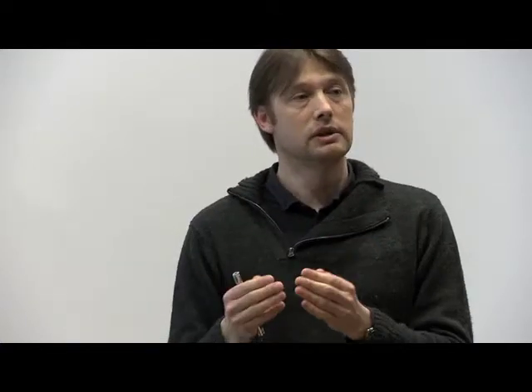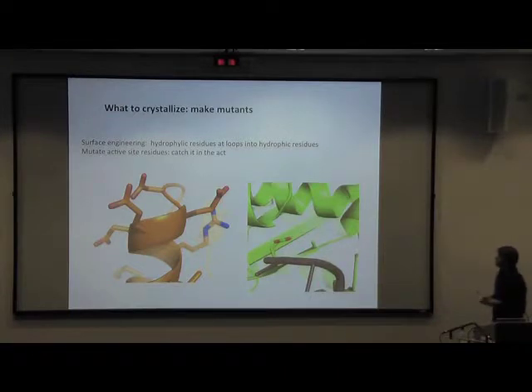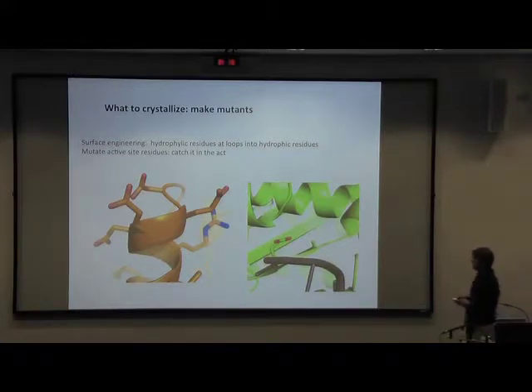So if you don't have any homologous models to do this, you can base it simply on the sequence, and predict which area might be suitable to change. And that, again, is varying the properties of the protein, not that you destroy the structure, but make it more likely to crystallize. On the other hand, if you know that you've got a catalytic enzyme that likes to, in this case, eat up DNA, and you want to have a co-crystal structure, obviously you want to do something to prevent the DNA from being eaten up.